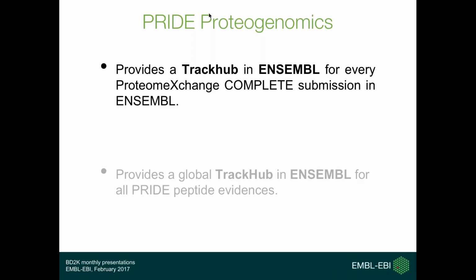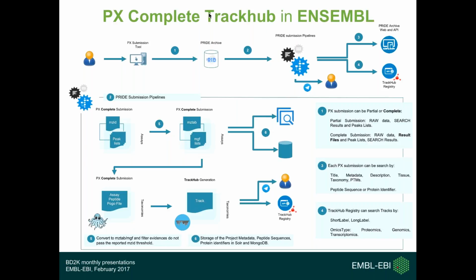Yeah. Then the main idea with this project is to be able to represent, as I said, proteomics data first in the Ensembl browser, but also in other browsers. First of all, I would like to explain how the data flows into the PRIDE database.